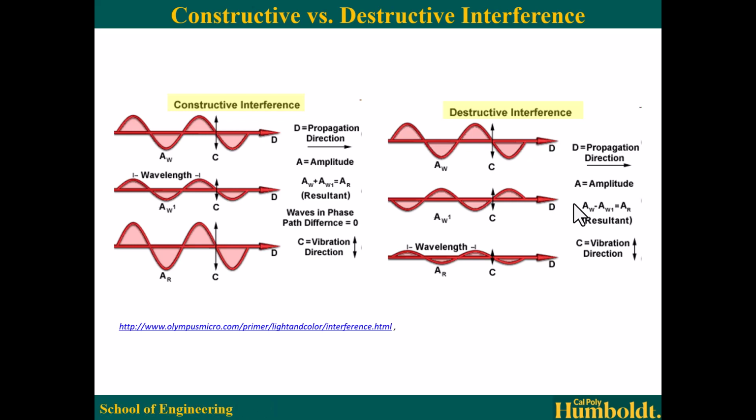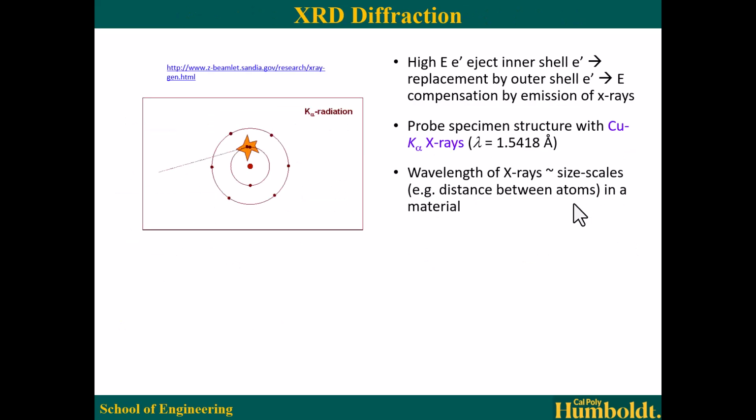And that is going to allow us to determine what I like to call characteristic distances in materials. So distances that effectively occur throughout the material. And you can imagine, right? We're not pointing our X-ray at a very particular single atom or plane or very specific plane of atoms. It's hitting everything. We're going to see these consistent distances that reoccur in a material.